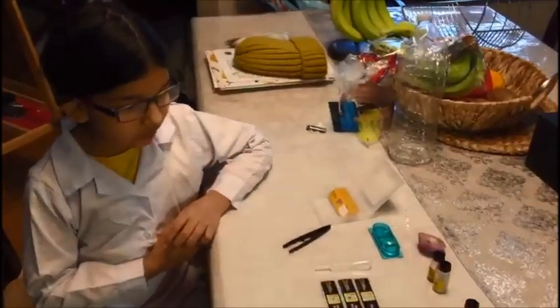Hello everyone. Today I have a National Geographic Microscope and Science Kit.